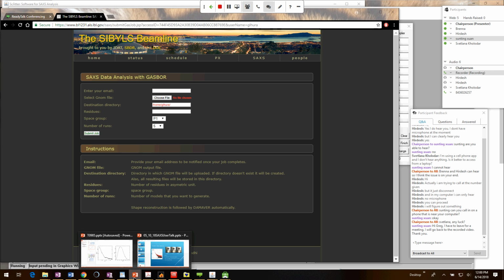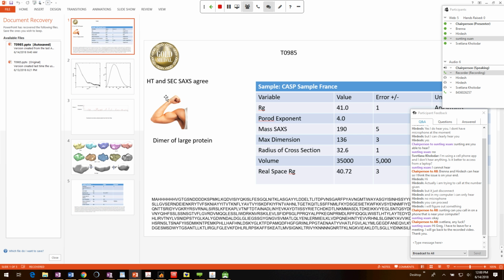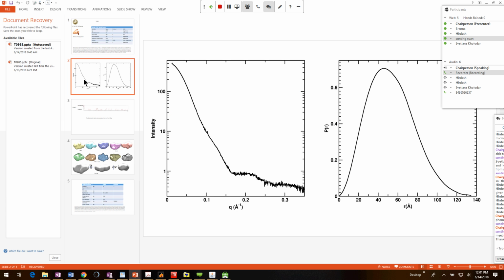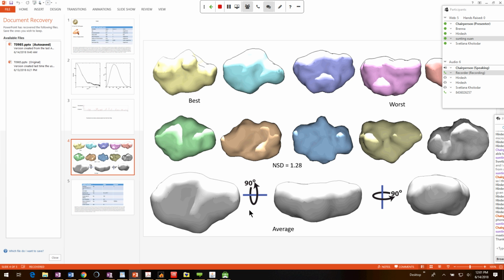And usually the packages I end up sending or processing, this is again for a particular project, are highlighting how good the experiment was, what the challenges with it were, sort of the things that I mentioned already that we get: the scalars of the data, the molecular weight, the scattering profile, the P of R function, and then these shapes that you get. So this is the average of the 10 runs together, and these are the individual 10, how they look, how they vary from one another.